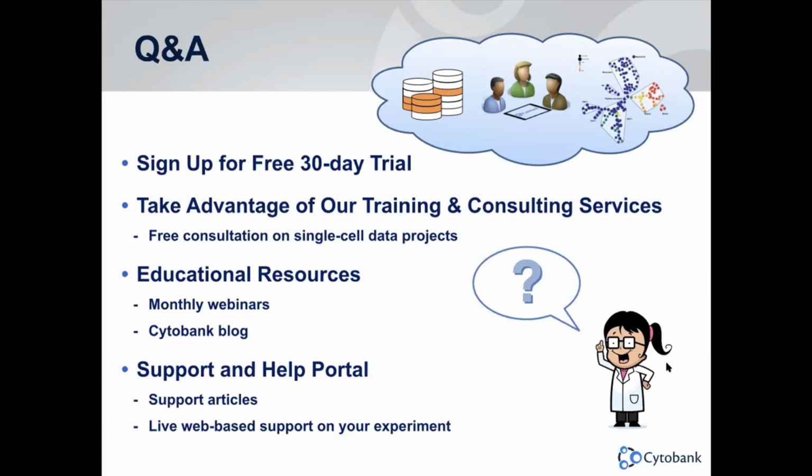And that number should come from some educated guess. So if you know the heterogeneity of your population and you have some general understanding of what it would be, you can certainly use that as an initial number. You can also test different values and see the results that you're getting.